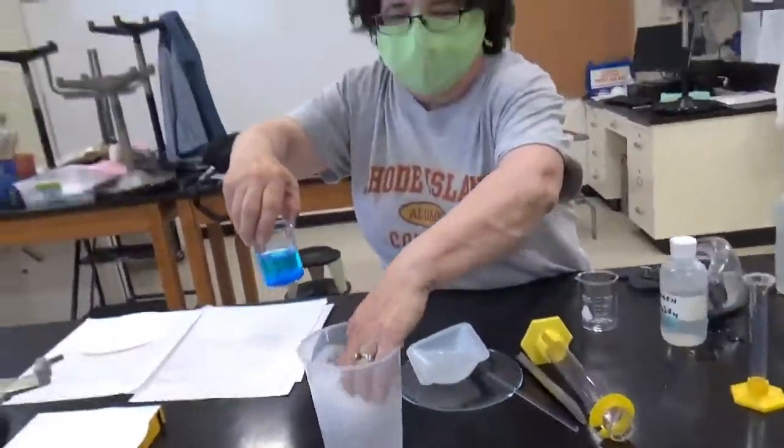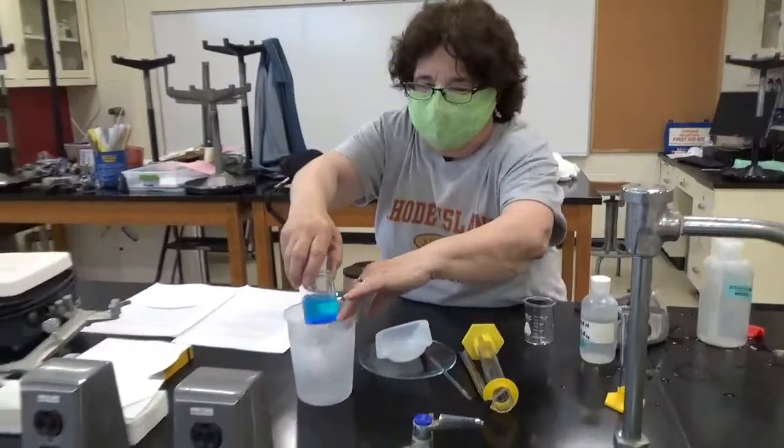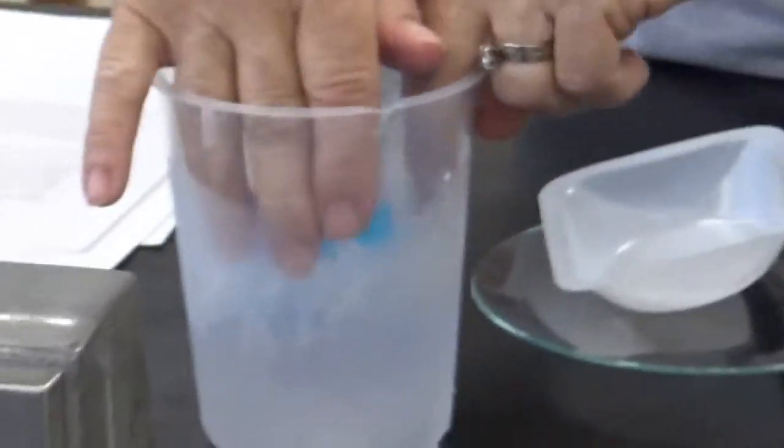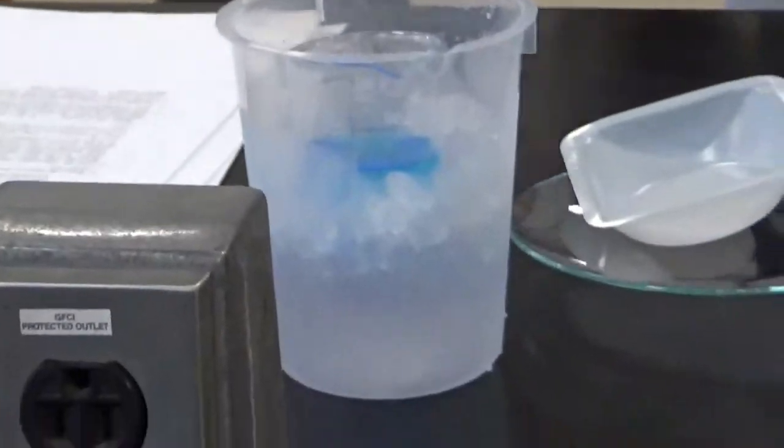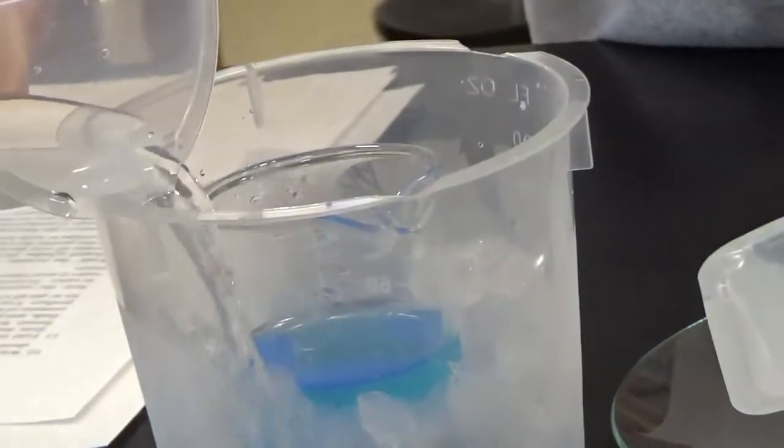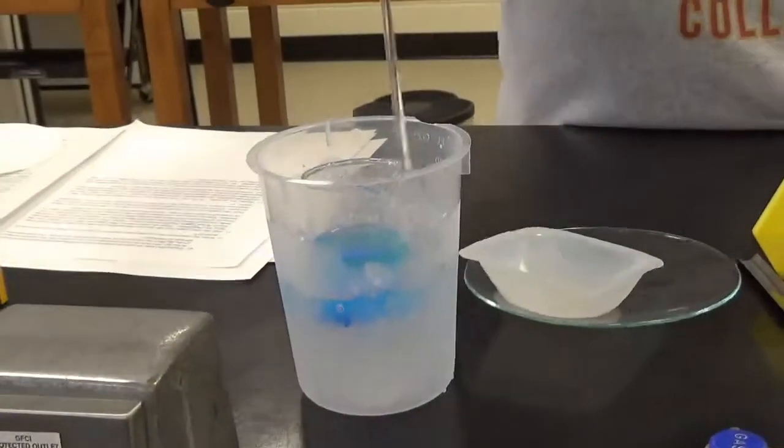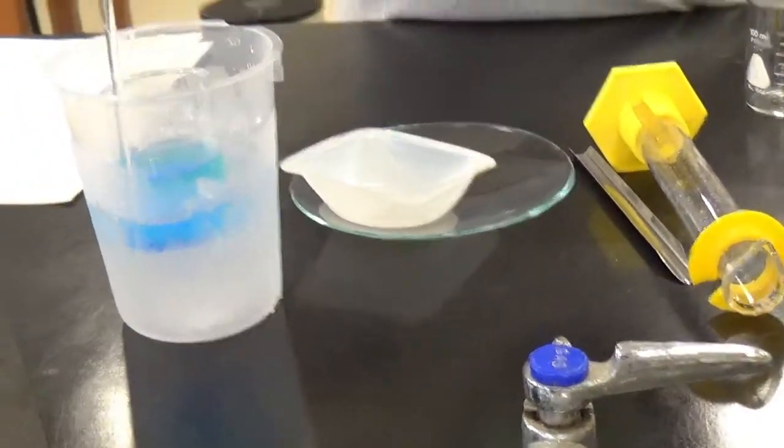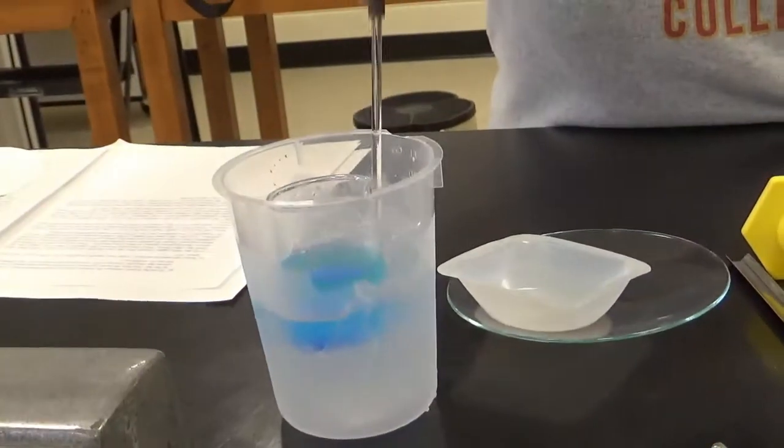We make an ice bath by putting some ice around the beaker and let it sit fairly undisturbed. You can put a little water in there too, but don't put water in the beaker. Now let's see if we notice any changes after a little bit.